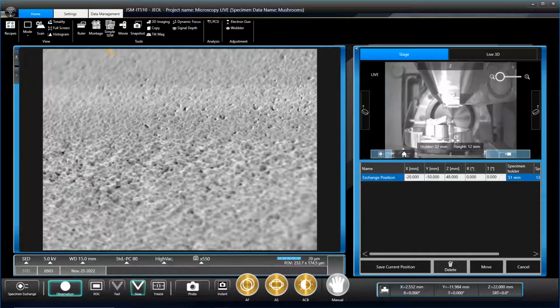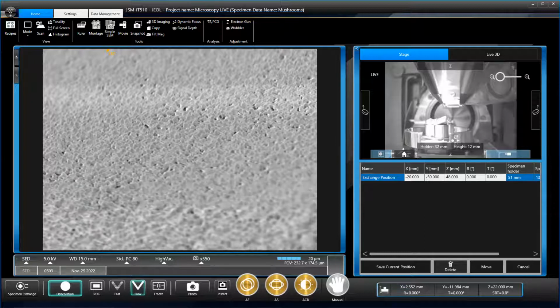Is this still the oyster mushroom? Yeah, still the oyster mushroom. This is slanty; the centre of the image is more focused than the bottom and top. Right, and then the facts about oyster mushrooms.